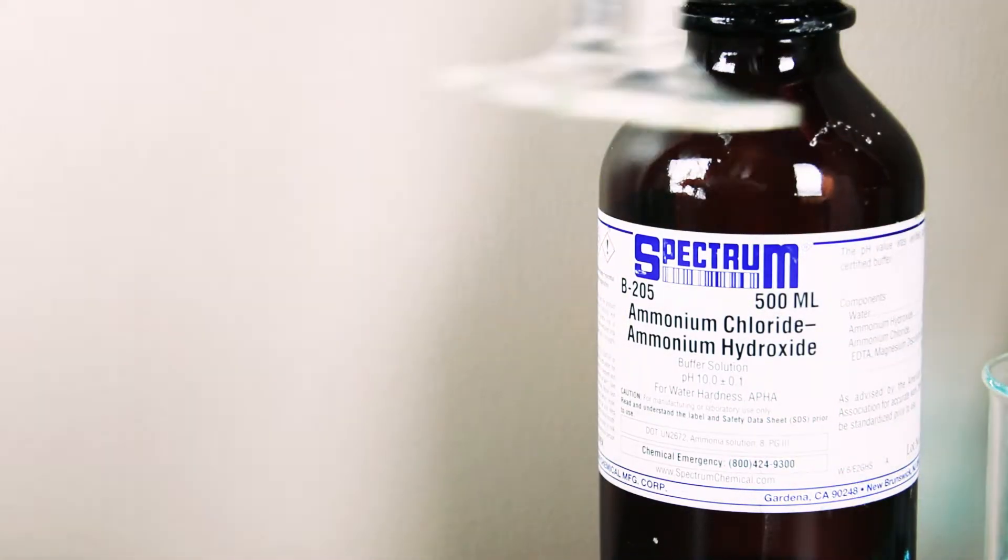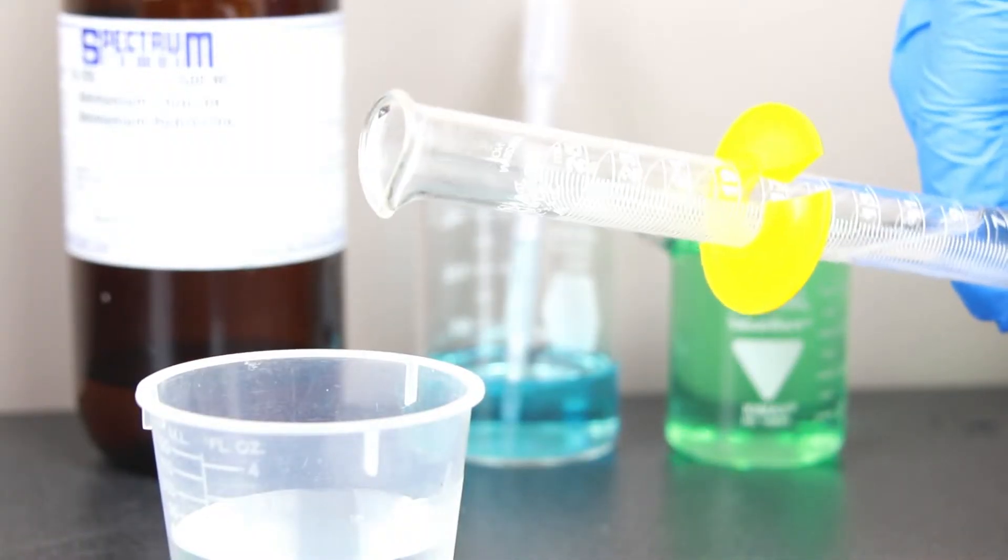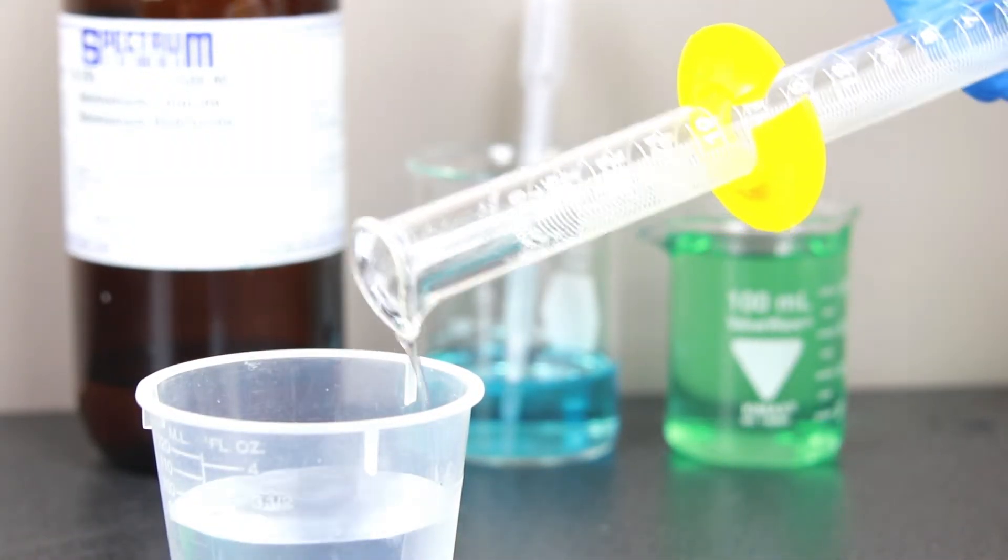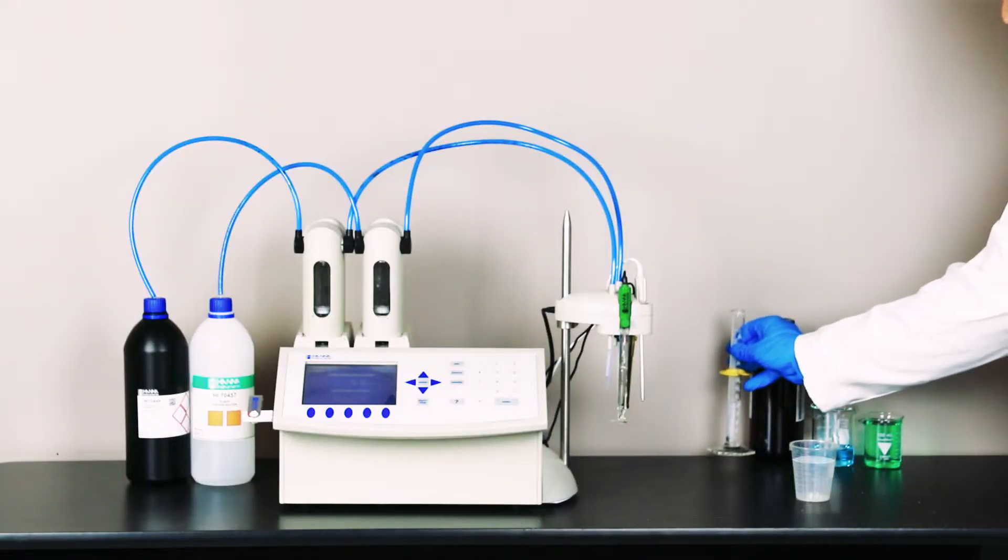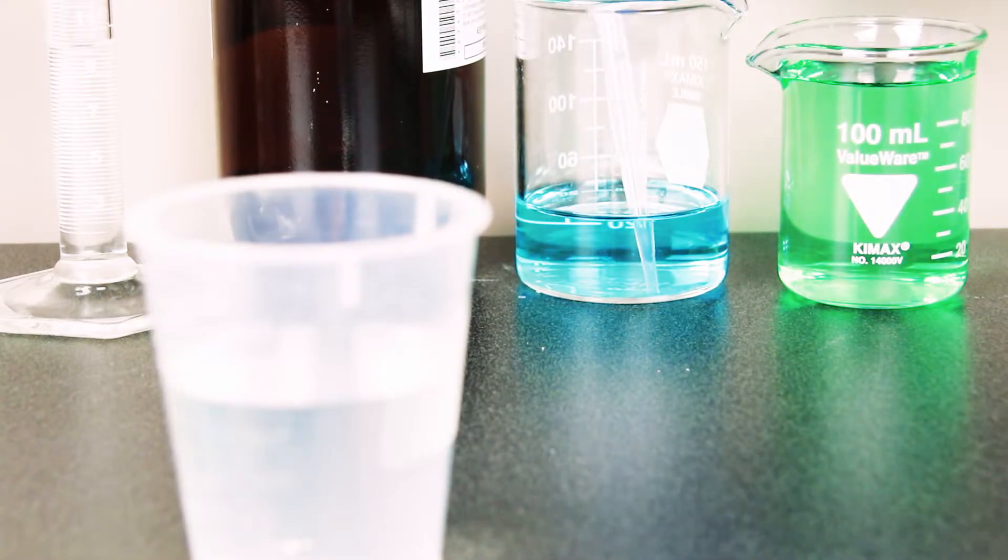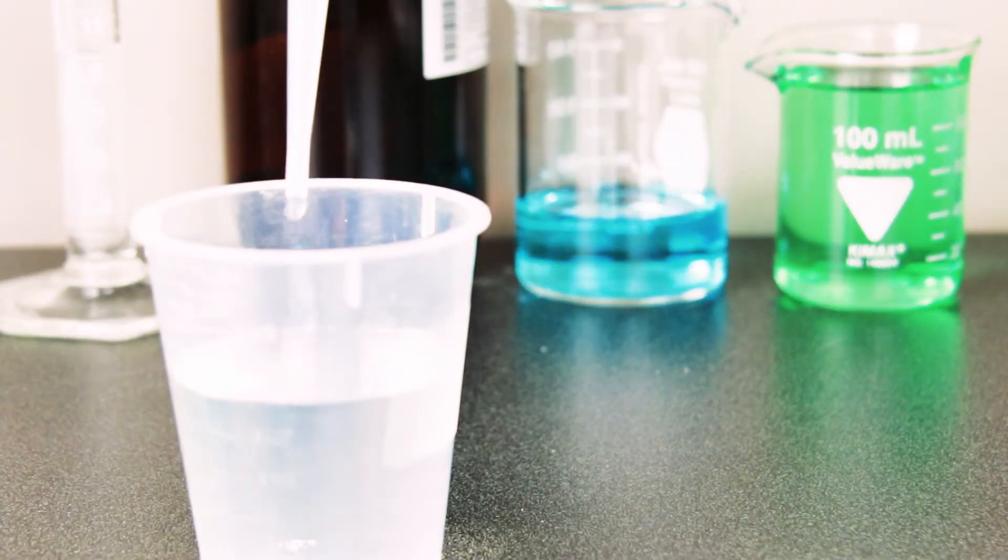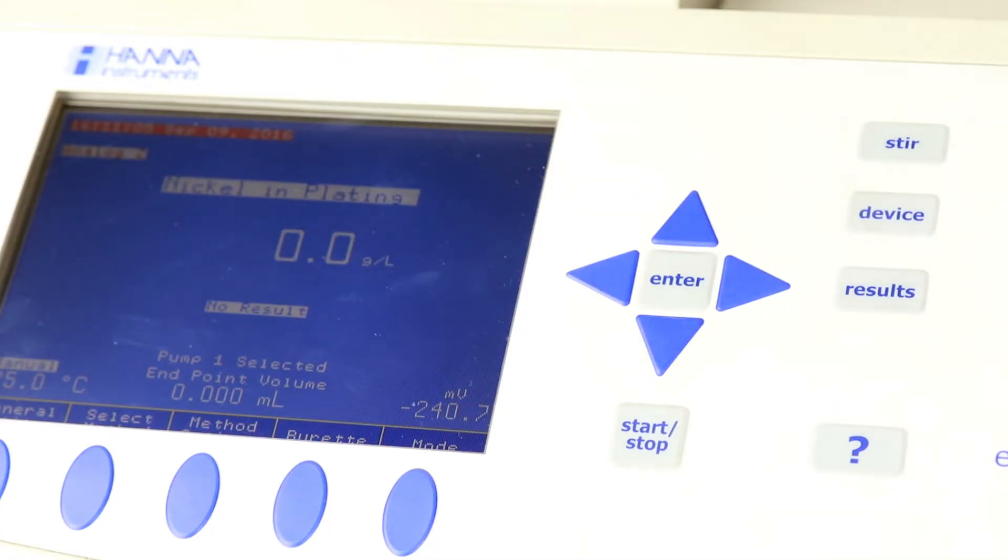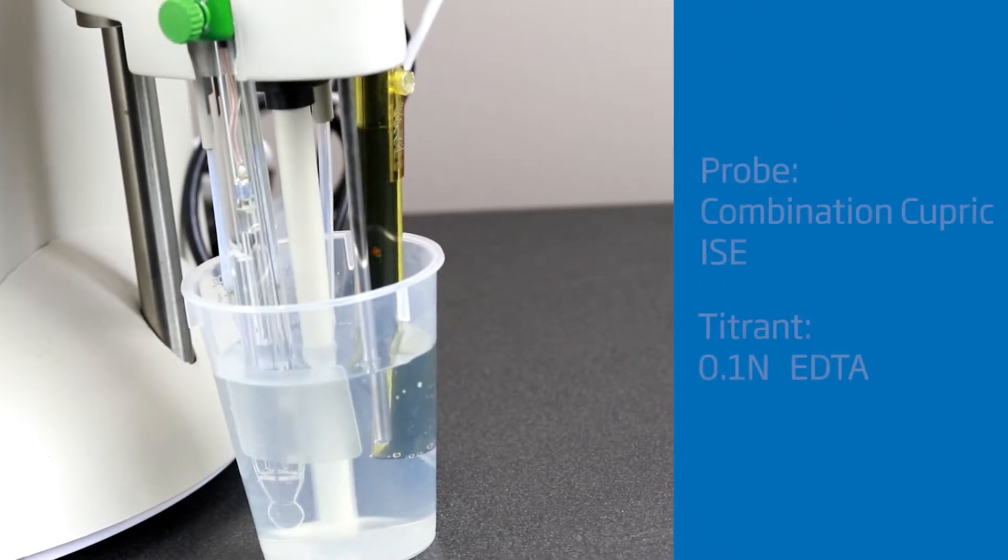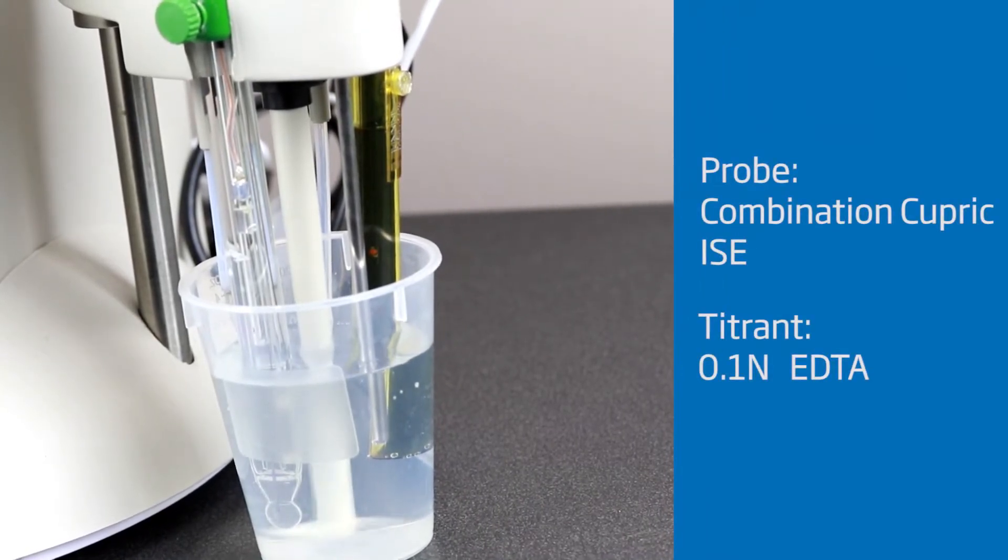Next, add ammonium hydroxide ammonium chloride buffer. Finally, add a few drops of copper EDTA. Now, just press the start button to titrate the sample automatically. This method uses EDTA to complex nickel in the sample to an equivalence point.